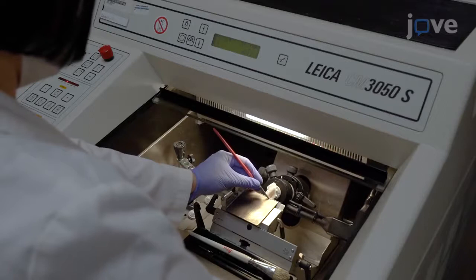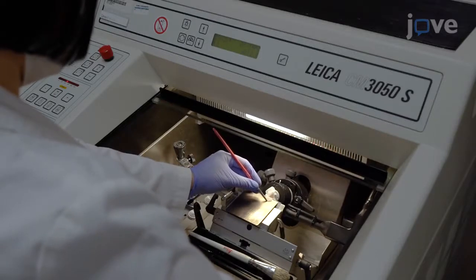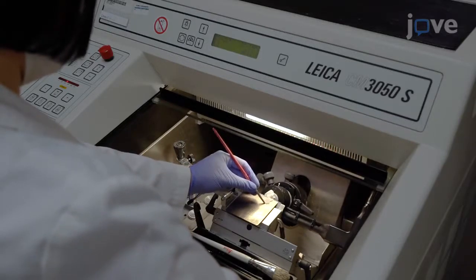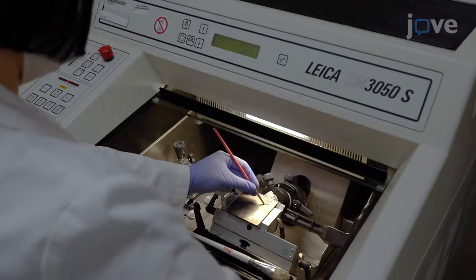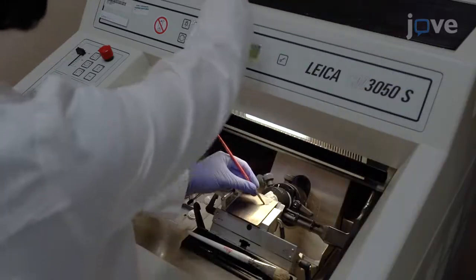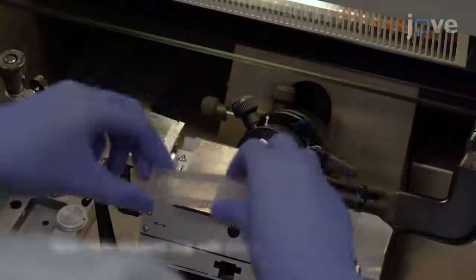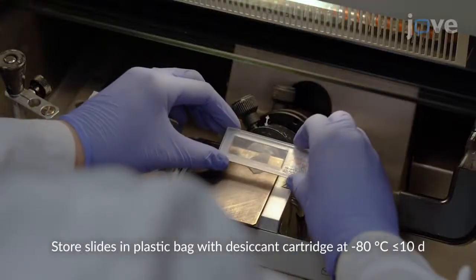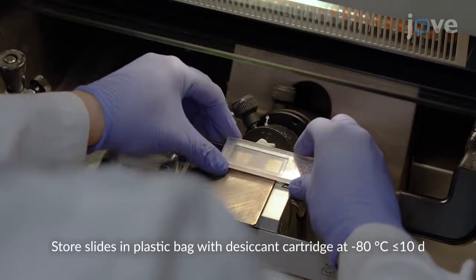After acquiring the tissue sample, use a cryostat set to minus 20 degrees Celsius to cut the specimen to a thickness of 12 micrometers and use the slide adapter to fix the specimen to a specialized laser microdissection slide.